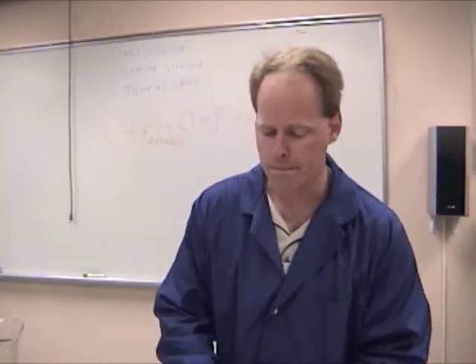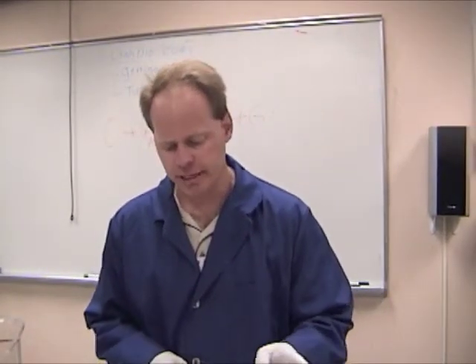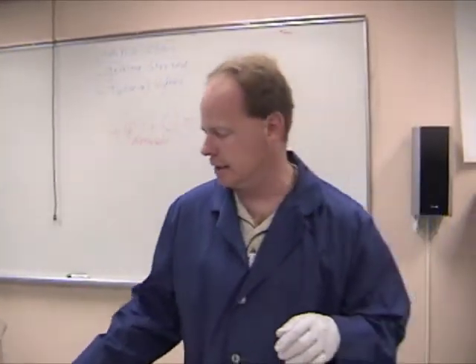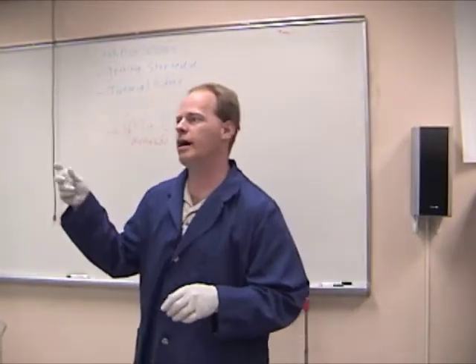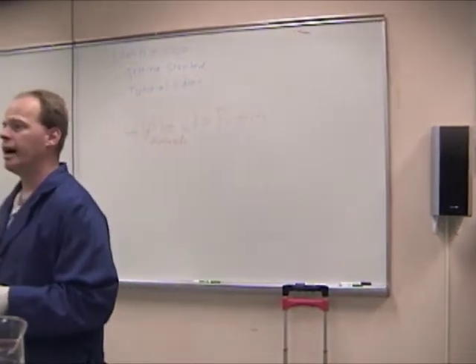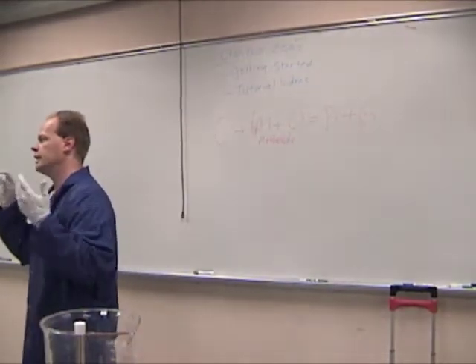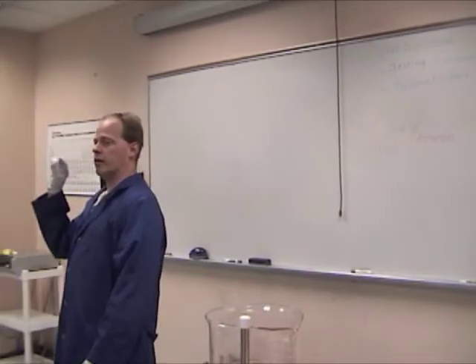Okay, so we've got potassium hydroxide we're going to be playing with today. You notice that mine is sealed, and it's sealed on purpose. If I pop this lid open and start breathing on it, I can what's called carbonate it. Well, it's not good for me to breathe in either. It'll react with air on contact.